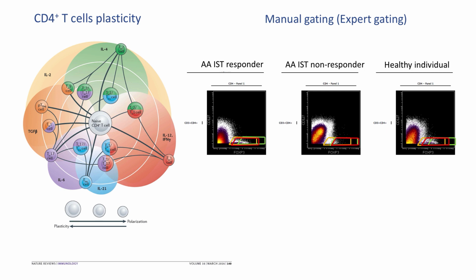As long as you do an experiment within your own lab and you compare your results within your lab, perhaps it's not an issue as such. But if you want to compare your results between centers or do a multi-center study, that's when you have the issue and you cannot compare your results.